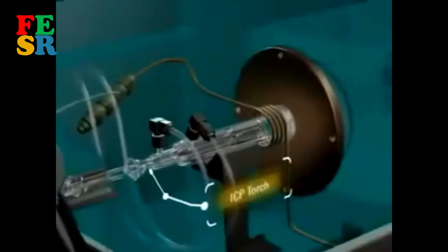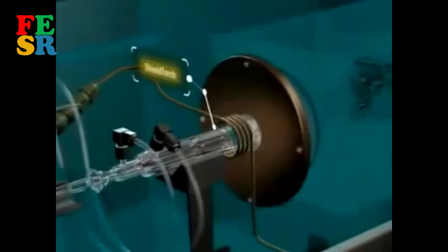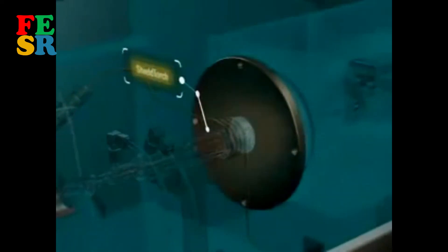Ion generation takes place in a high-temperature 27 MHz plasma. Agilent's unique shield torch system reduces ion energy spread, allowing optimum ion focusing and increased sensitivity. The off-axis ion lens system ensures high ion transmission across the entire mass range, plus low background noise.